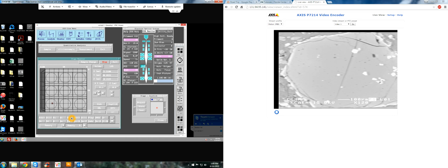tutorial. So we're creating a new group, and then hit OK. This is kind of like a big folder where you keep all your quantitative analysis. Then at the bottom here, if you want to start a new quantitative analysis, hit New, and here we can just say olivine example. Click OK, and then hit OK.